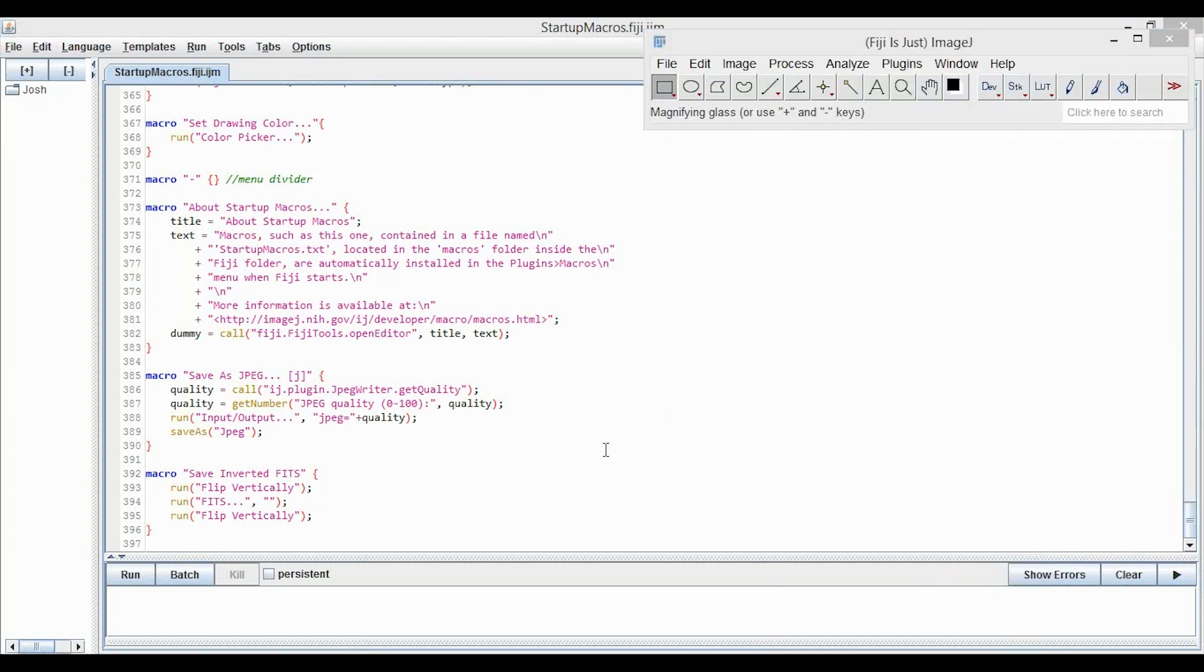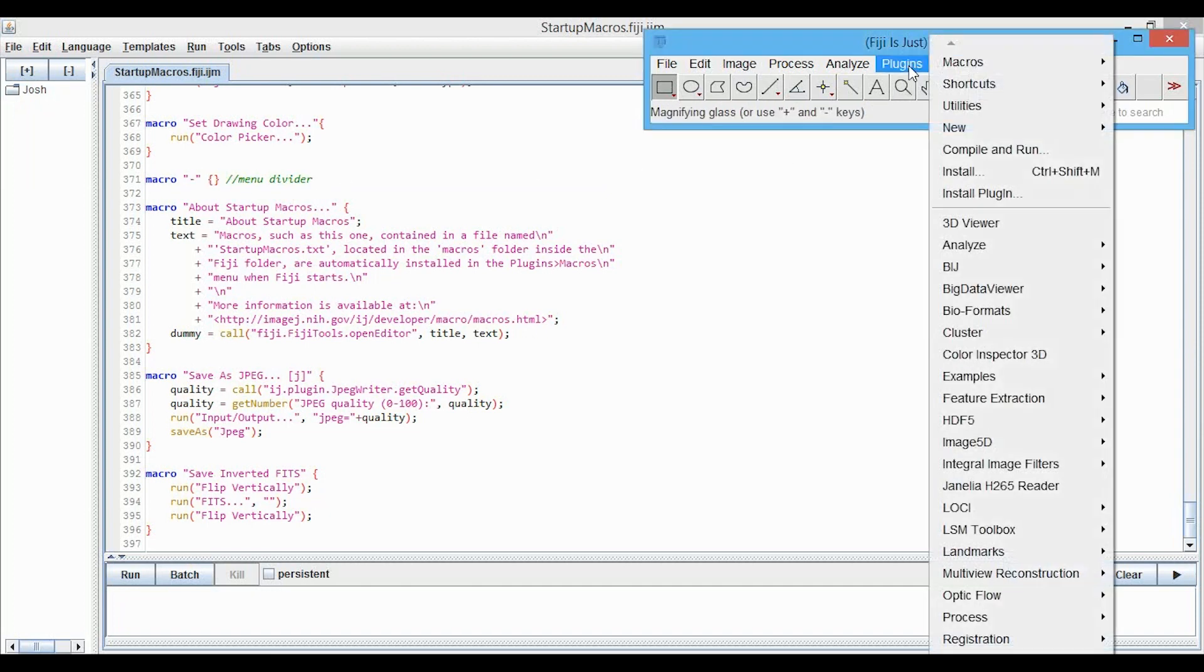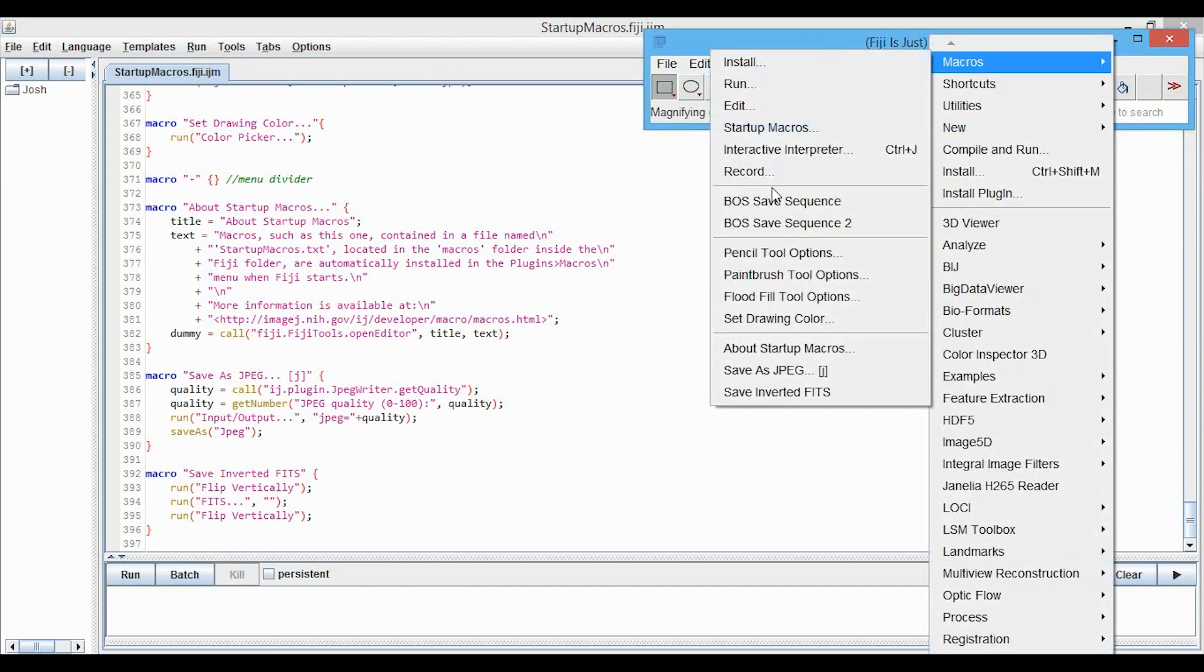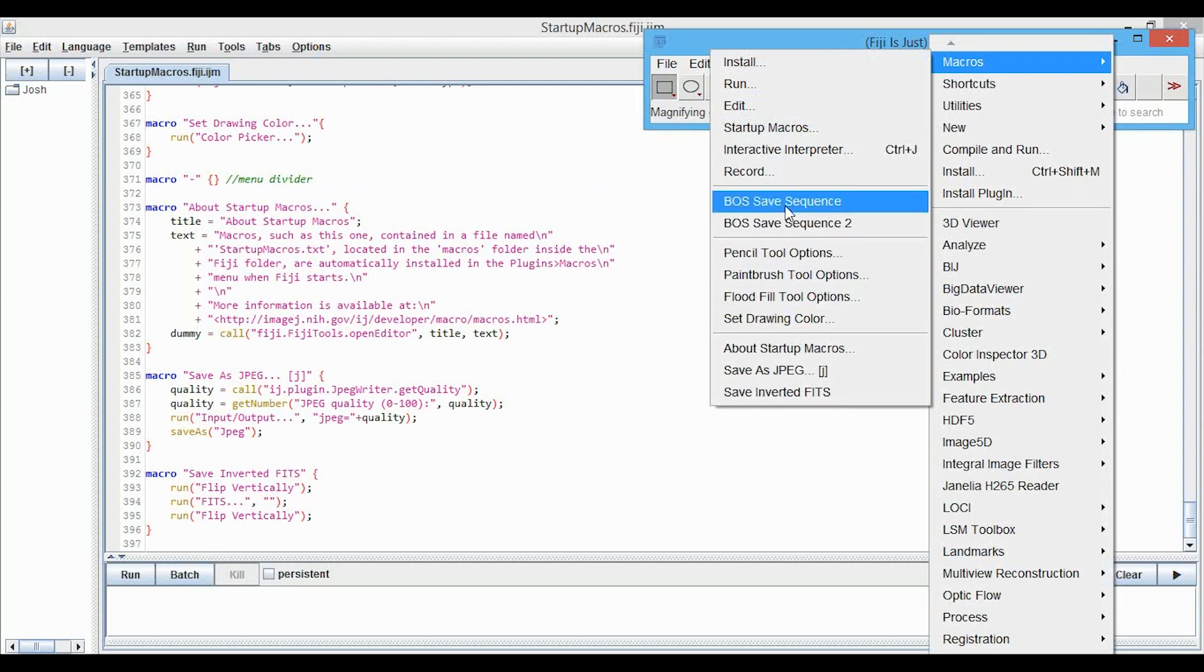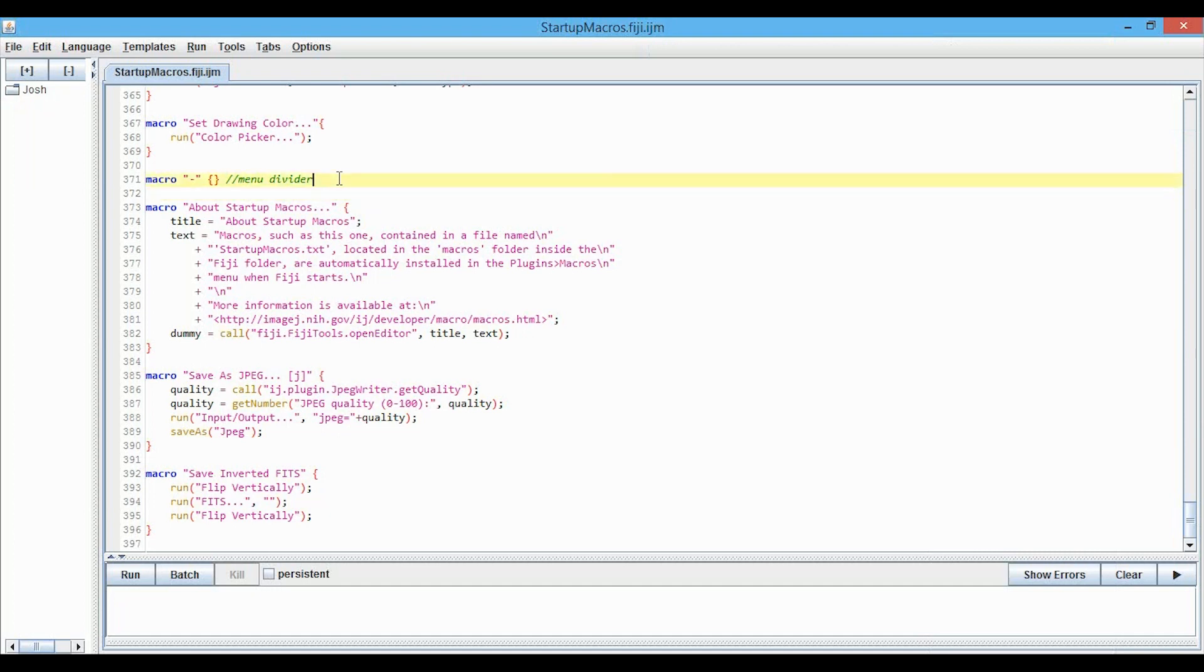So we're just going to copy this formatting for our macro, but first, you can see up here this macro dash, and that's the menu divider. That is, if we go in here again, that's this line that appears between certain sections that can isolate your macros a little bit better.